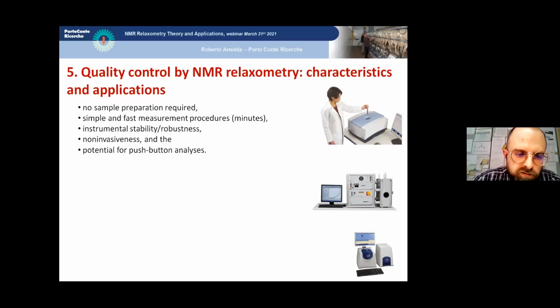There is no need for over-specialized personnel, given suitable user-friendly software or interfaces optimized for specific applications. Routine maintenance, especially for fixed-field benchtop instruments, is very easy and quite inexpensive. Benchtop NMR instruments are relatively cheap, heavy duty, small, and can be easily implemented in small laboratories.